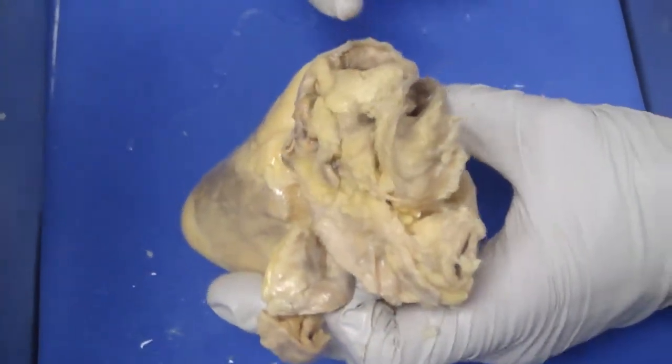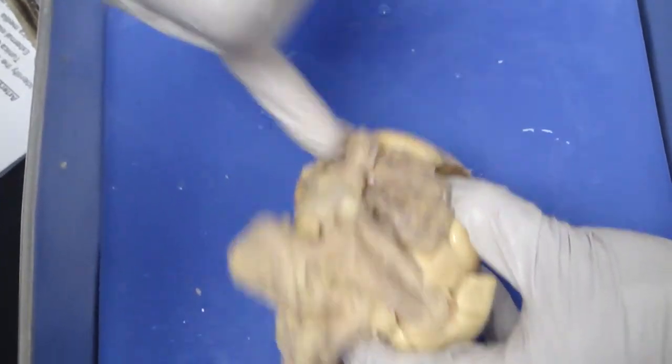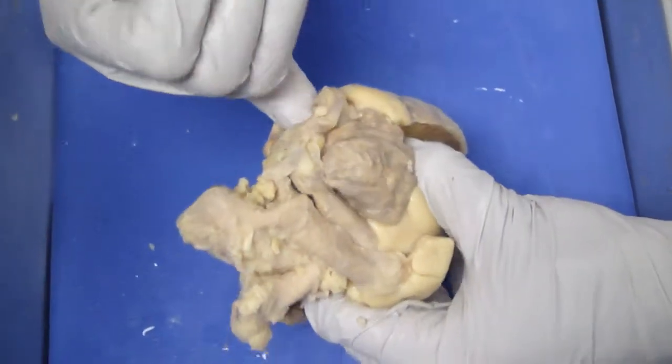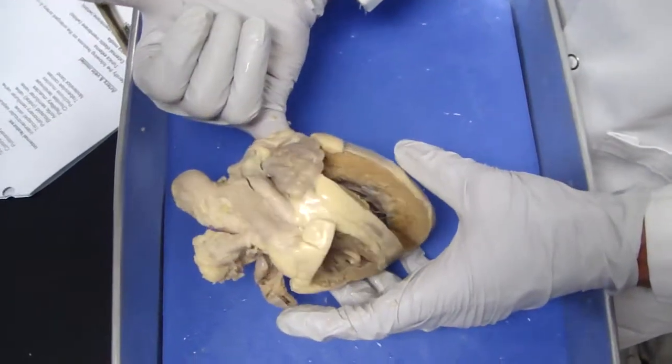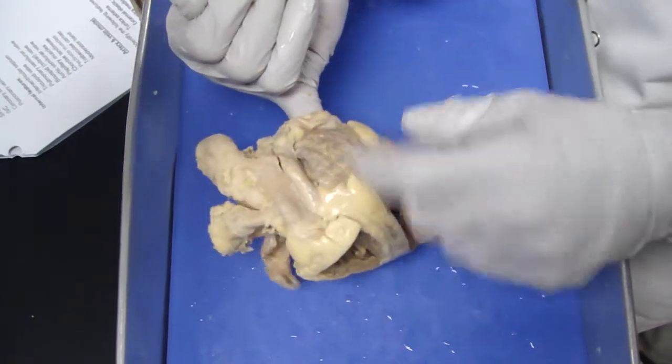And then this is pulmonary vein. Yeah, so we have pulmonary vein. So if I stick a rod in here and you can tell it's projecting right here, you should be able to figure out that's got to be pulmonary vein. It's bringing blood to the left auricle.